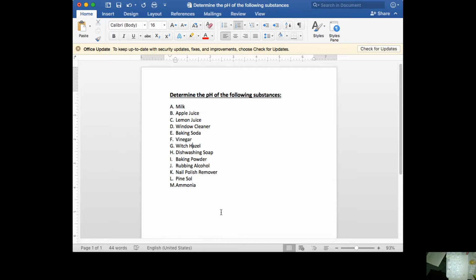Okay. So you think it's a base. How strong is a base? The further you get towards 13, it's a stronger base. So these are weak ones. This is stronger. This is weak. This is stronger. So where do you think it goes? So you think it's a strong base. Okay? Where do you think apple juice goes? What's that? Neutral. That's all you're doing. And then we're going to test them. Get them all down. You have to list where all of those go.